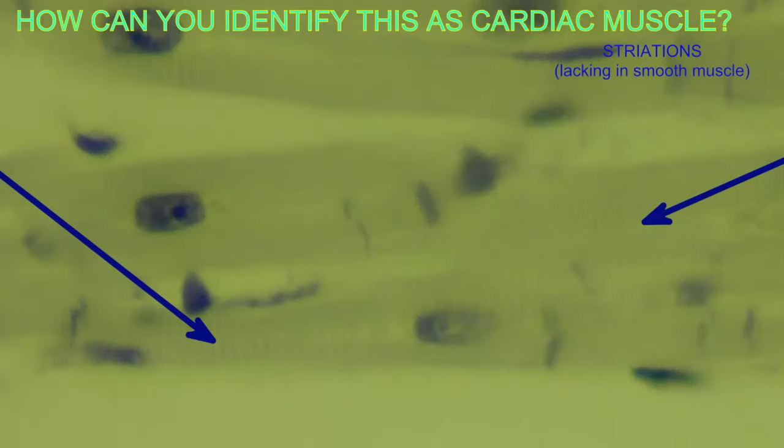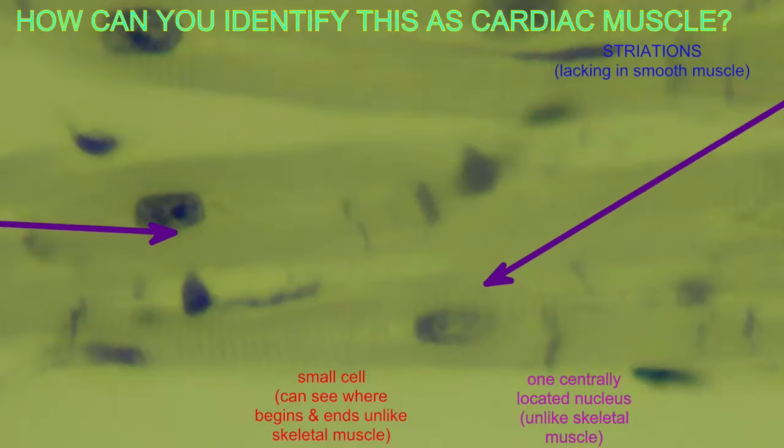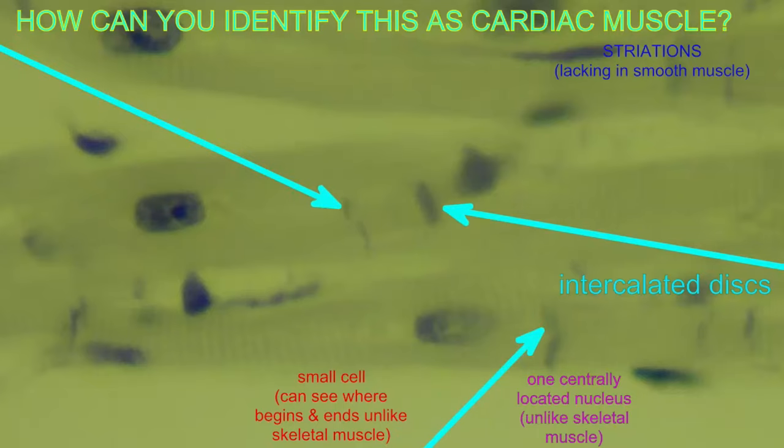Because heart muscle generates such pressure when the heart contracts, these cells need to be firmly attached to each other. So where cardiac cells meet, there are thickenings, intercalated discs.